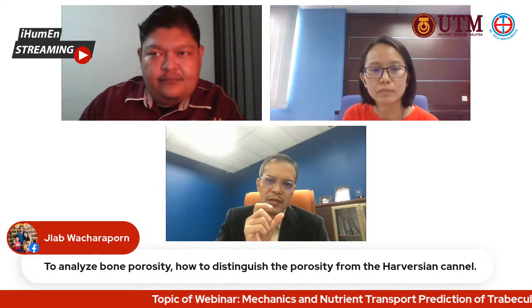Maybe I can add something. Actually, we can differentiate during the reconstruction, with the voxel value. Let's say the bone is 1,000 something, and the Haversian channel has a different voxel value. Then you can generate different features for the Haversian channel or the porosity of the bone itself.